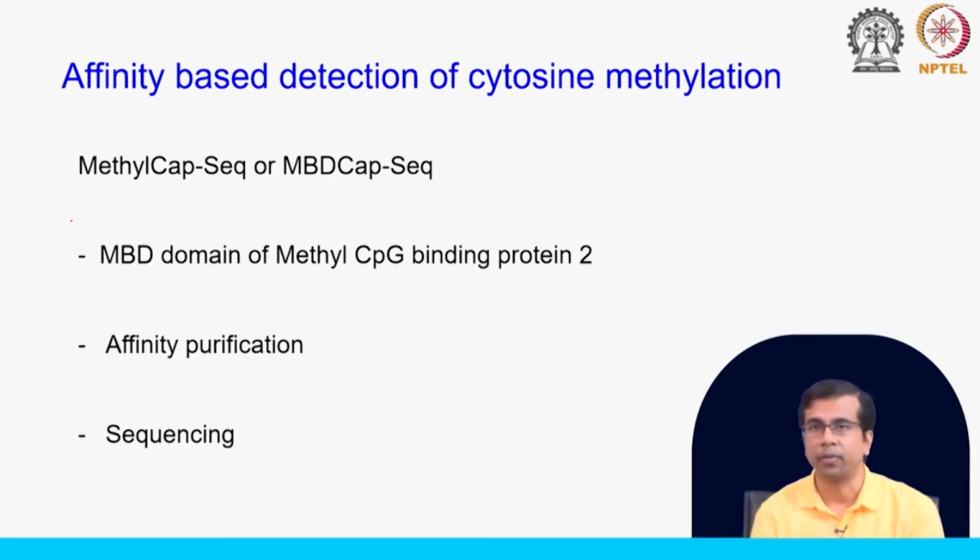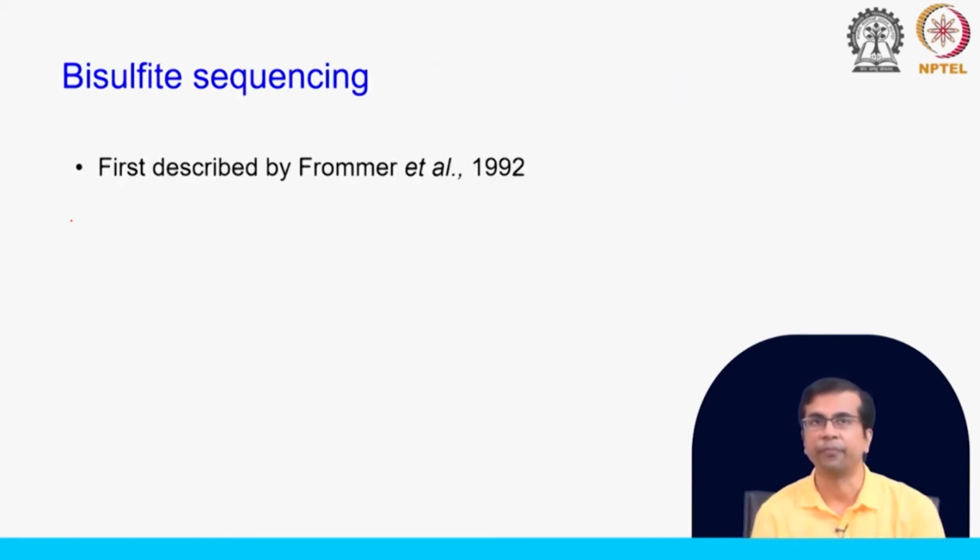Again, the drawbacks are very similar, right. So, you have limited resolution, and again you have to run a control experiment.